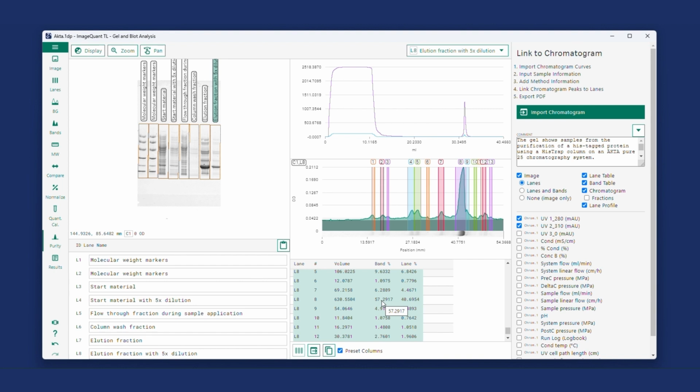And that is actually showing the limitation of Coomassie staining. So if there is not enough sample to stain, that means that the weak proteins, the impurities, will fall below the detection limit. So if the user is not careful, it might appear that you have a purified protein, but you are actually not staining such low amounts of impurities if you dilute the sample. So please be a bit careful with dilution when you do Coomassie staining, and it is of course better to have more sample in your lane and to detect also the impurities well.